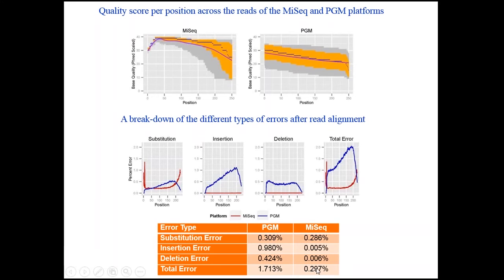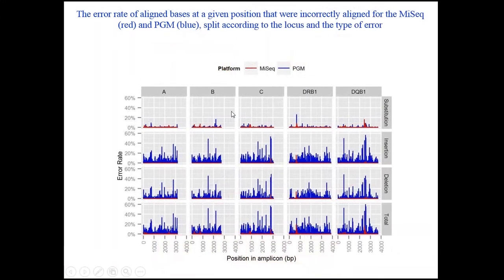So, MiSeq technology was assessed based on these two metrics as the better technology. And now we are referring to elements that relate to the instruments. We don't talk about the different protocols for library preparation. These are strictly measures that relate to the instrument.